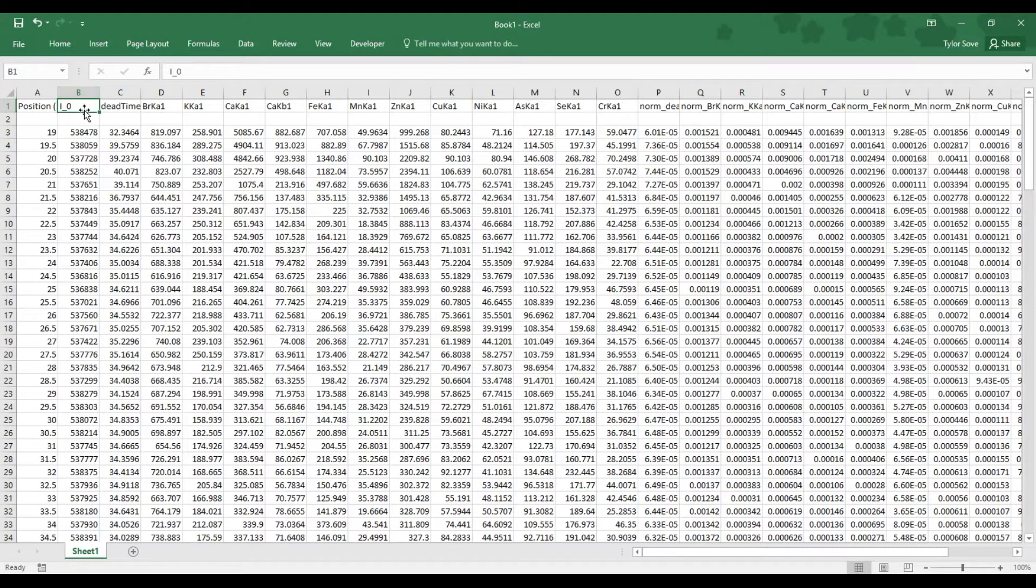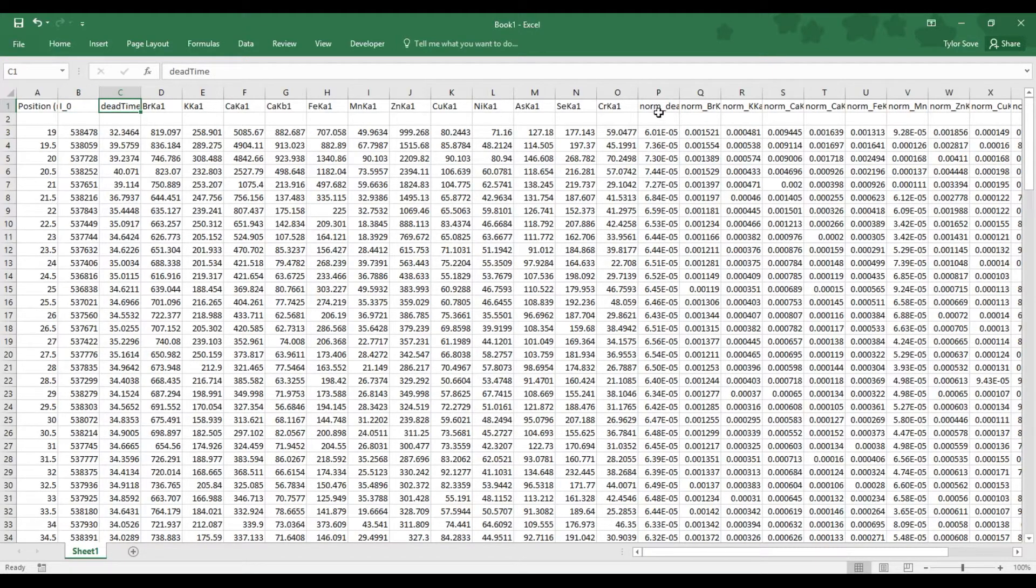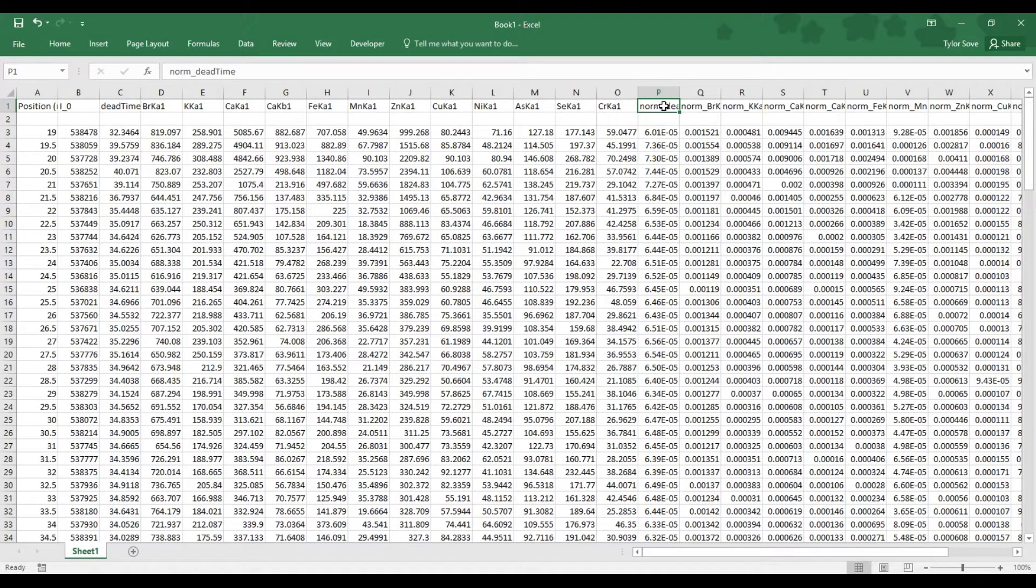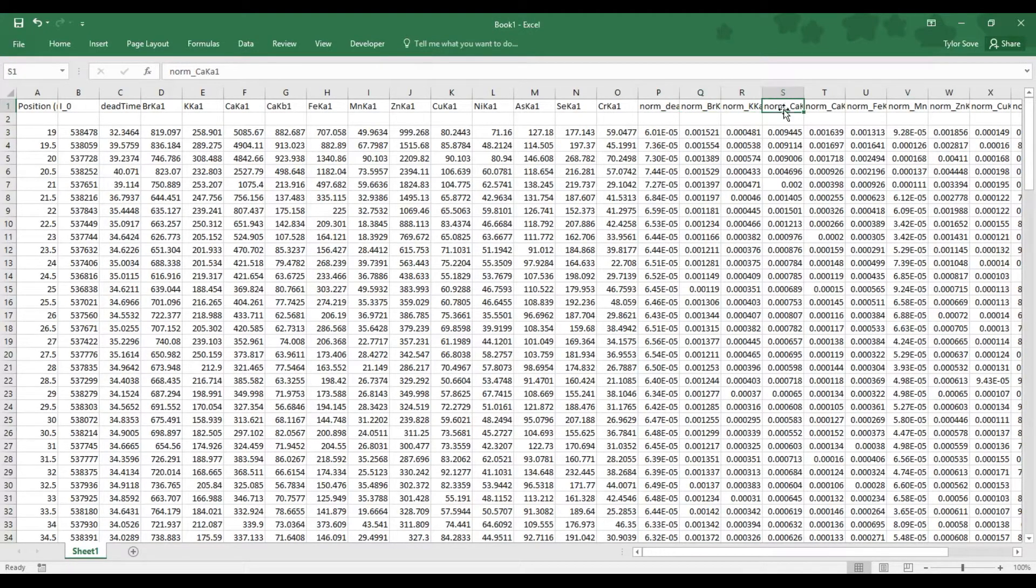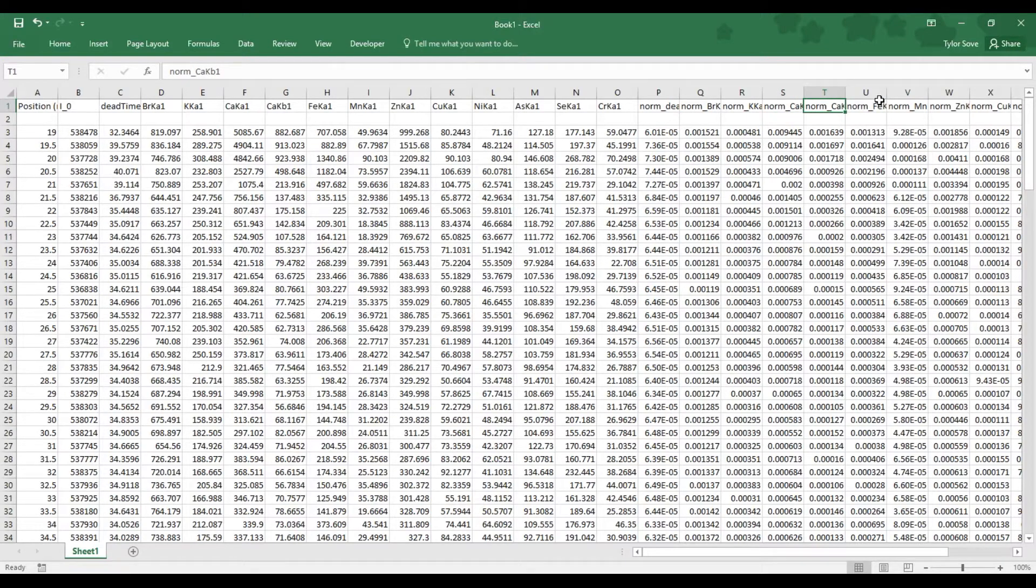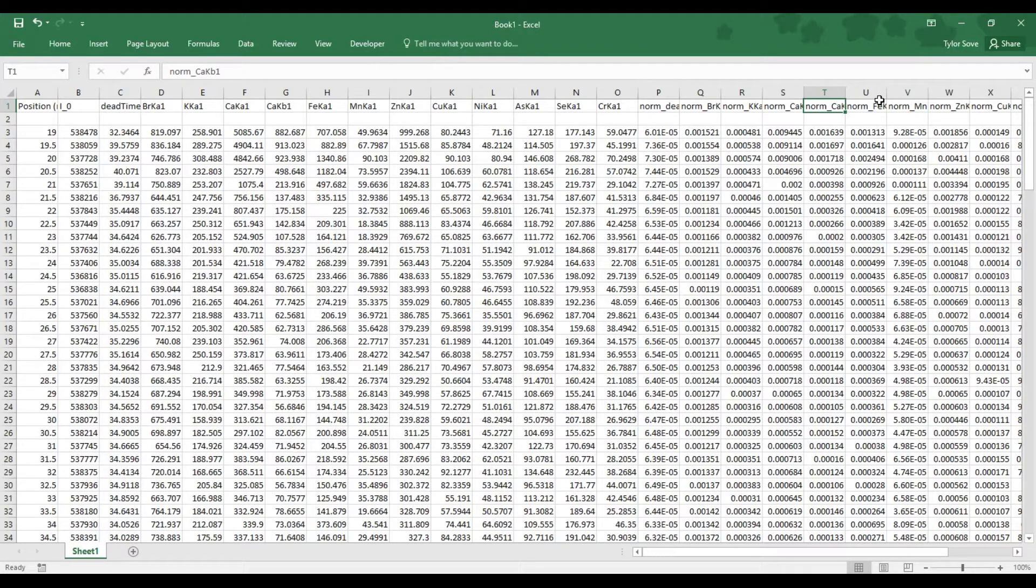Now, in column B as denoted by I0, in column C as denoted by dead time, in column P as denoted by norm dead time, and in all of the remaining columns as denoted by norm and insert element here, these are extraneous data. We do not need them for the graph that we are interested in.